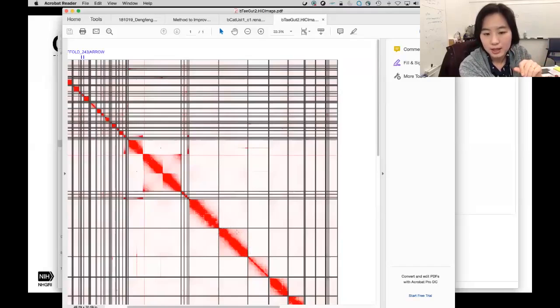And you can see that it's blurring out, gradiating out when it goes far, which means that there are some small interactions that have very long distances. For example, a dot here is an interaction between this position and this position.